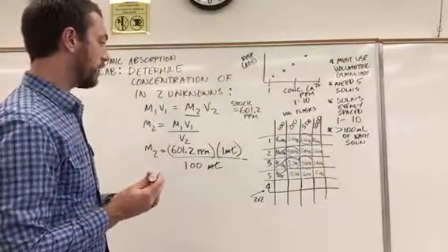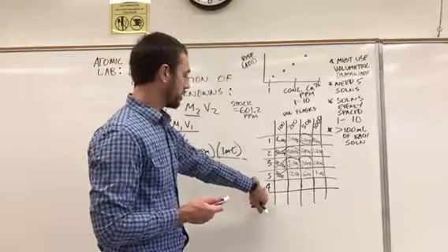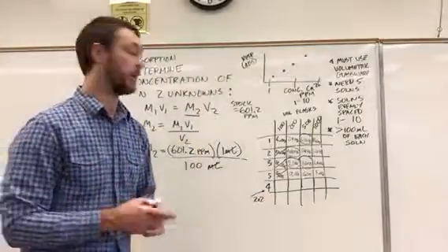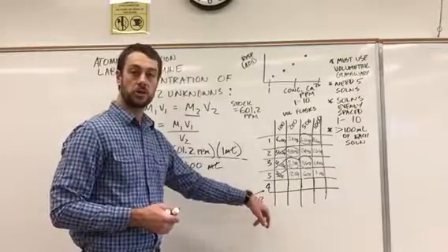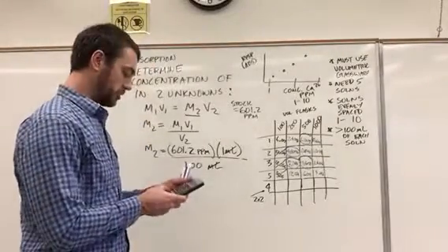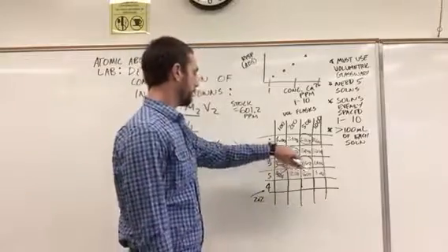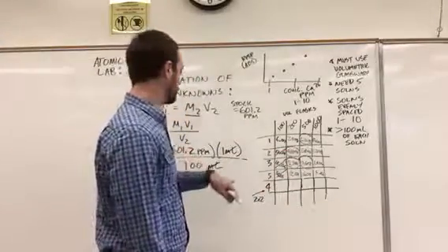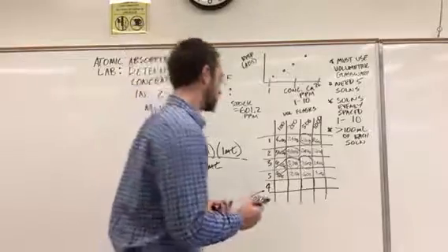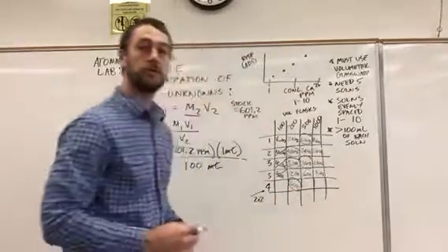And so that's why I indicated that you could use here a solution that's prepped from 4 milliliters of a volumetric pipette. Now you don't have a 4 milliliter pipette. So what you can do is you can use 2 aliquots of your 2 milliliter pipette to get that concentration, okay? And you can see that if we did that, I'll just use my handy calculator here. If we used 4 milliliters of this 601.2 ppm solution and diluted it to 250, we'd get a concentration of 9.6192, which is pretty close to 10. And so that's the 5th solution that I would end up making.